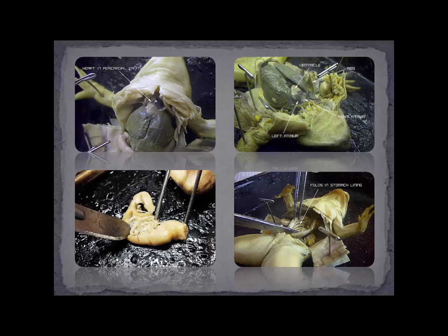In terms of the digestive system, my students always find it interesting to open up the stomach and have a look at the contents. In this case there's nothing in there. But you can see these folds that increase the surface area of the stomach and help with the churning of food.